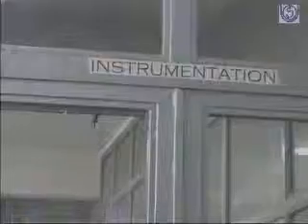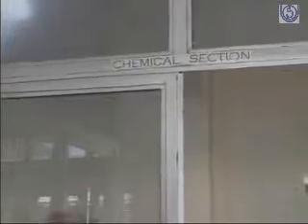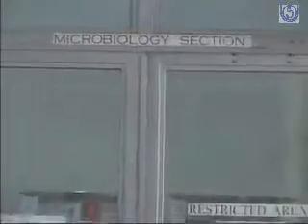And generally, in food testing laboratories, there are three sections: instrumentation, where the different instruments are there; the chemical, where the wet chemical analysis is done; and the microbiology, where all the pathogens are tested. Now I'll let you know each individual equipment and its usage in the laboratories and the different sections.